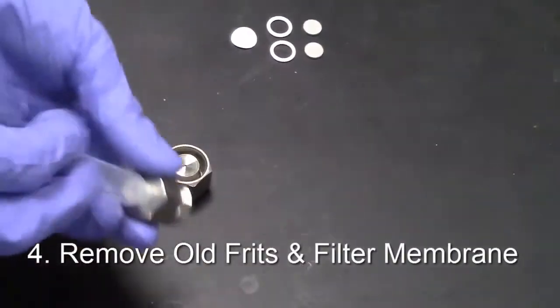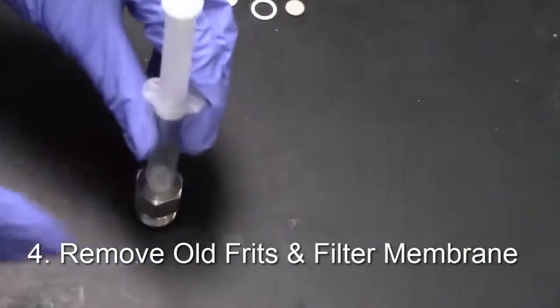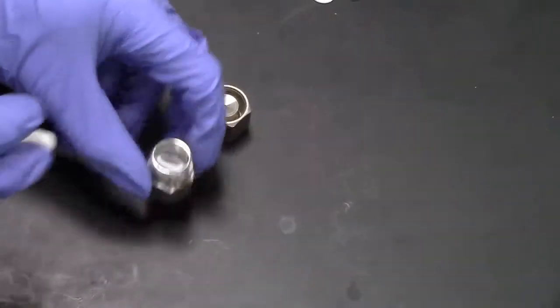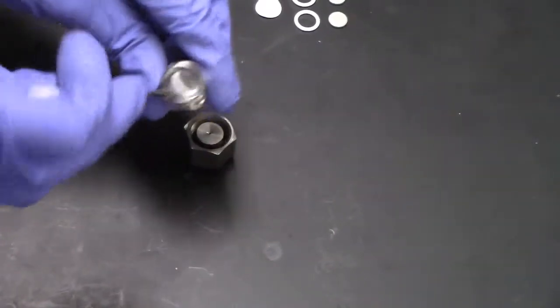Step 4. Remove old frits and filter membrane. Use the syringe to pop out the old frits and filter membrane. Additional tools, such as a screwdriver, may be helpful in removing the old contents.